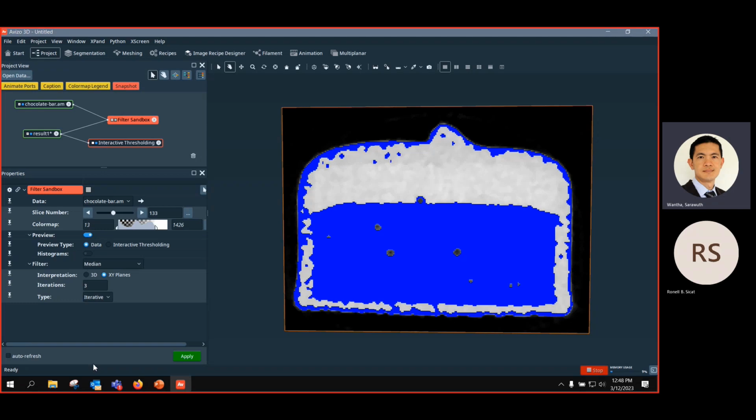You don't have to do normalization. You can already do it outside the computer. It balances them, and we just want to make it easier to group them.